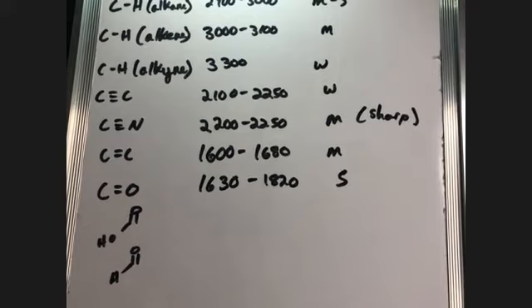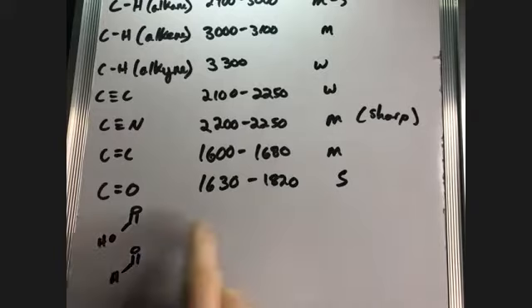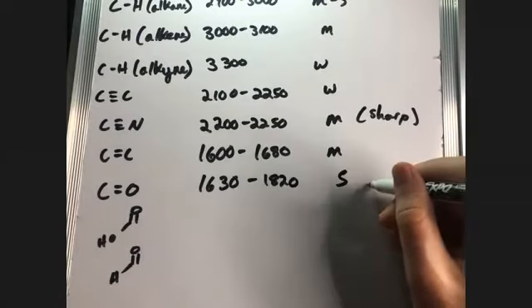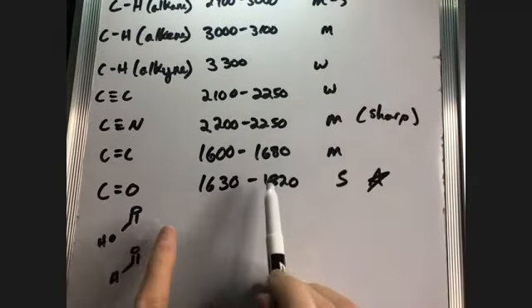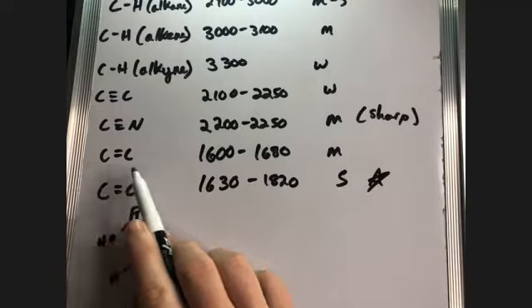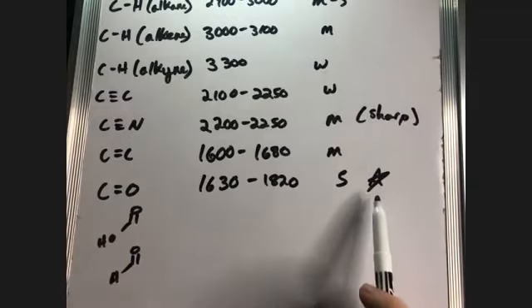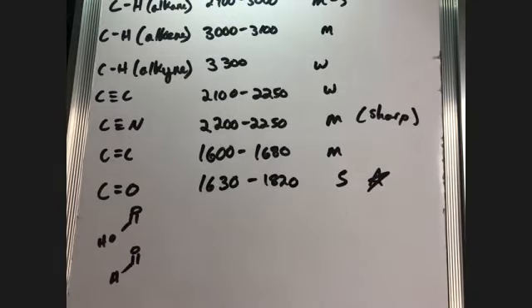So I think it's best to not memorize what all of these individual functional groups correspond to, but it's better to just know that this is the carbonyl and then use your NMR or your other data to figure out which type of carbonyl it is, because the IR for the carbonyl can be somewhat ambiguous. But you'll notice that it is a carbonyl because the regions of a carbon-carbon double bond and a carbon-oxygen double bond partially overlap, but the difference is the carbonyl is always going to be strong compared to the medium intensity of the alkene.